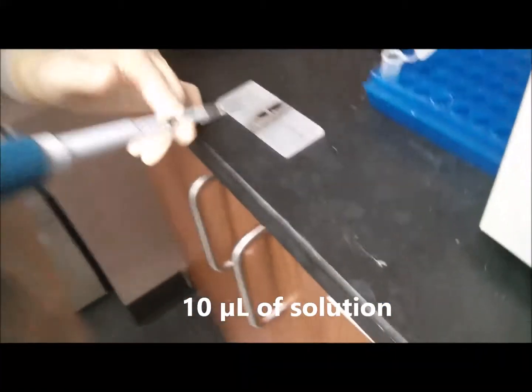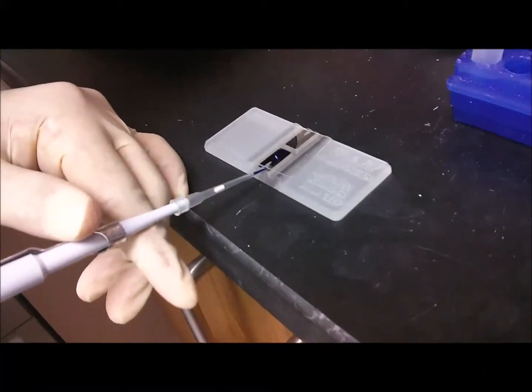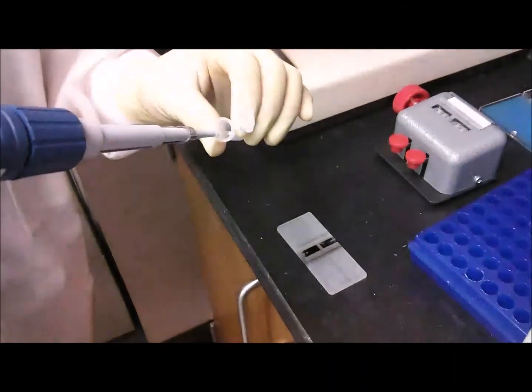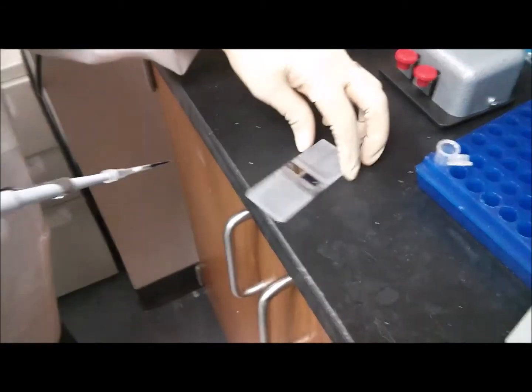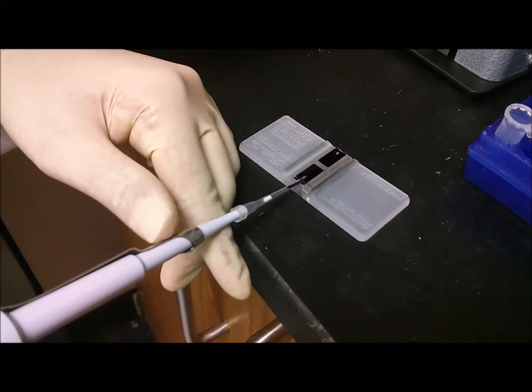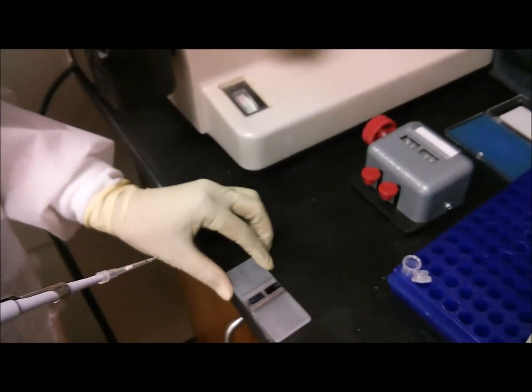Here, you need to take 10 microliters of the final solution and place it on one side of the hemocytometer. And then this needs to be repeated on the other side of the hemocytometer as well. Make sure that the blue solution covers the entire area of the hemocytometer right beneath the cover slip.